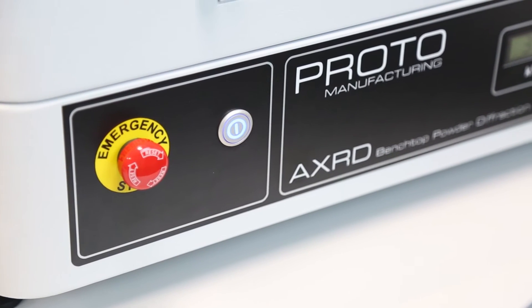I work with the AXRD Benchtop Powder Diffractometer. When I first started working with the AXRD I was really excited about its versatility. With 10 years of experience I've used a lot of different diffractometers but never one with this amount of versatility and such a small footprint.